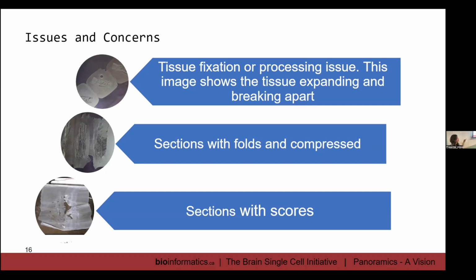And then the next, someone was talking about bone in the area earlier. This is an example of calcified tissue with bone. And it looks exactly like that when it comes off the microtome. When that happens, that means the tissue is actually either not decalcified or they never knew that there was calcification in the tissue as you get deeper into the block.